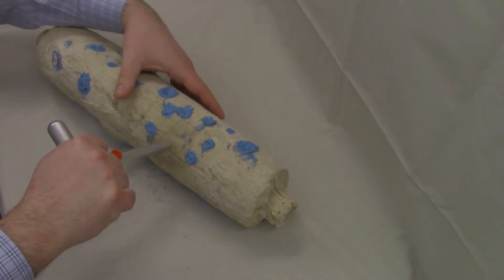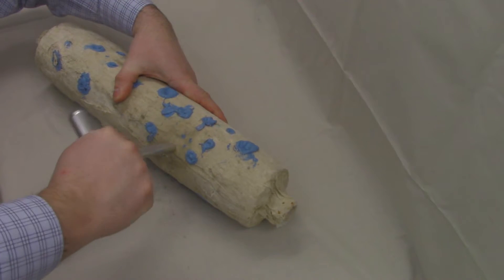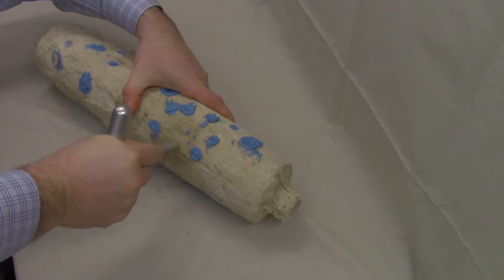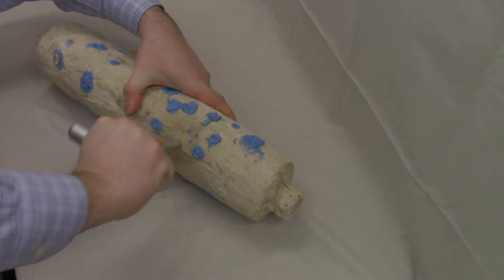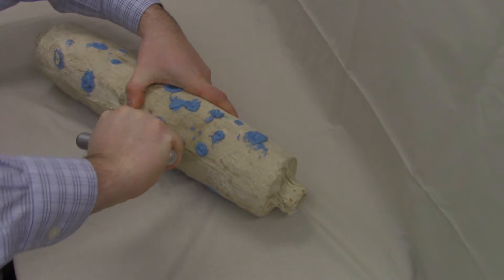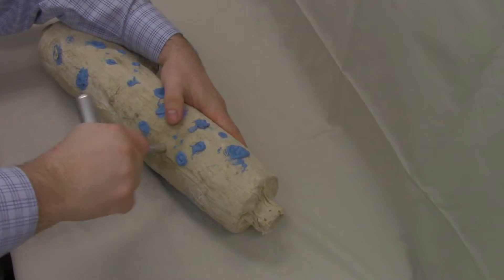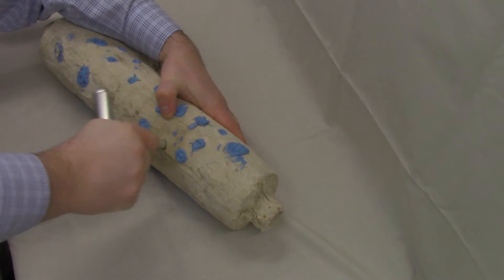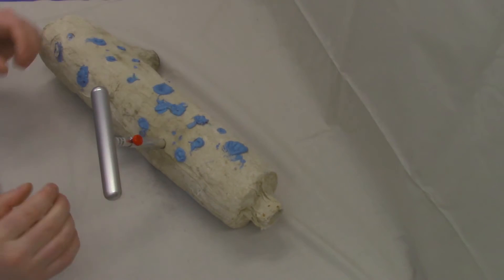Then we're going to take our cutter sleeve and rotate so hopefully you can see this a little better. And we're going to twist it back and forth while applying pressure in order to get through that canvas wrapping. Once we're through the canvas wrapping, I don't know if you can see that on the video very well, it slides much easier through the actual insulation material.